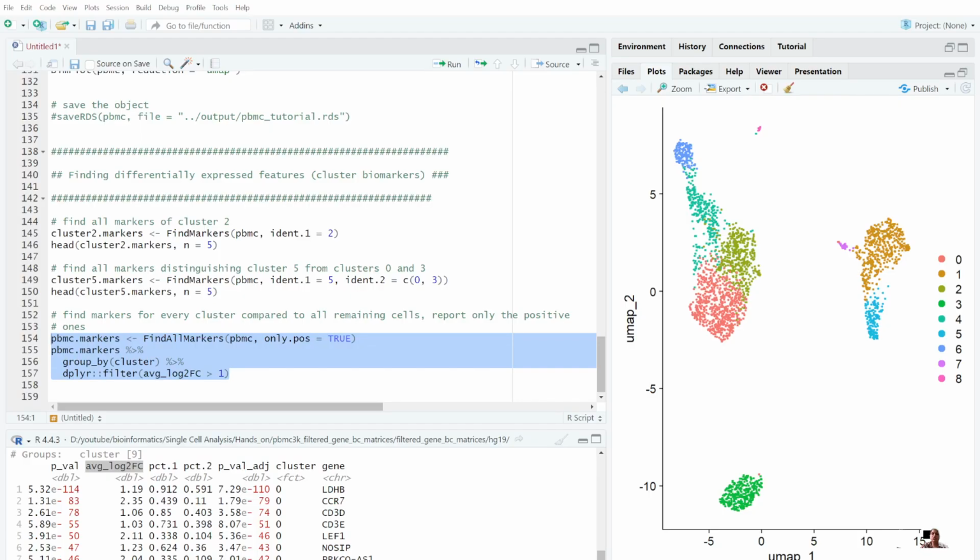of proper visualization. You can make proper volcano plots, heat maps and feature plots, which will be more informative when showing genes with meaningful expression shifts. And in fact, better downstream functional analysis can also be performed. Gene sets with large fold changes often enrich more clearly in GO or KEGG pathway analysis. So that is why we have chosen this particular metric for finding the marker genes.